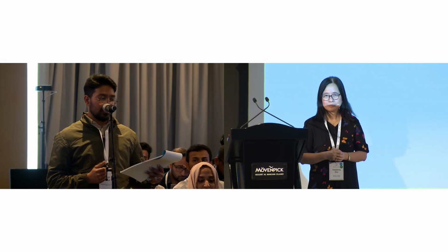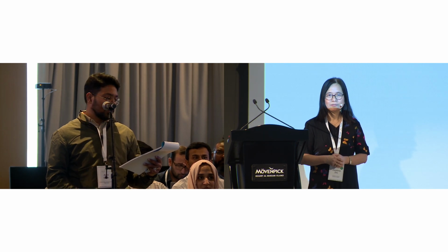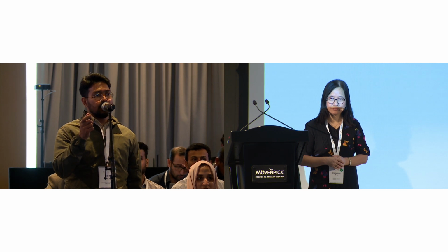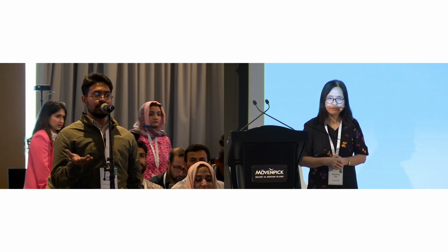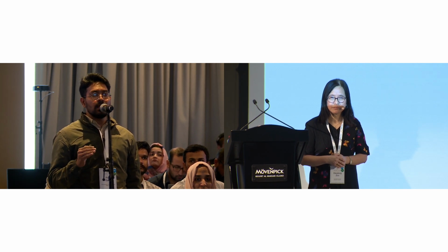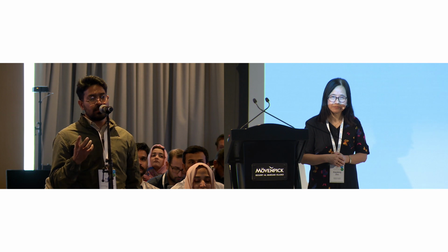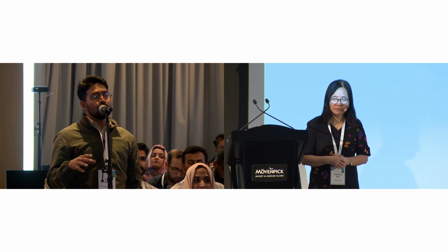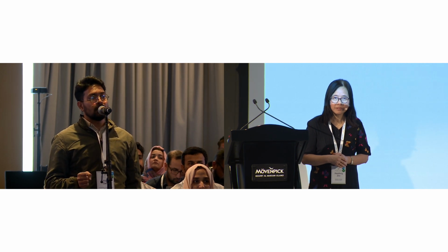Thank you. I think we have a question from the audience. Yes, I can hear you. Good morning. My question is, whenever we rotate the crystal, every time we get a diffraction pattern. Is there any minimum number of diffraction patterns we need to form a final structure?